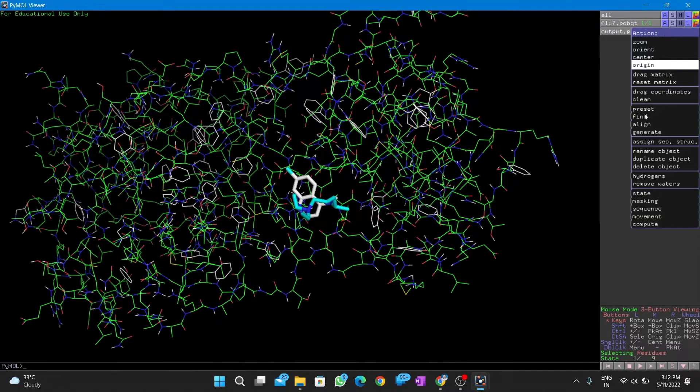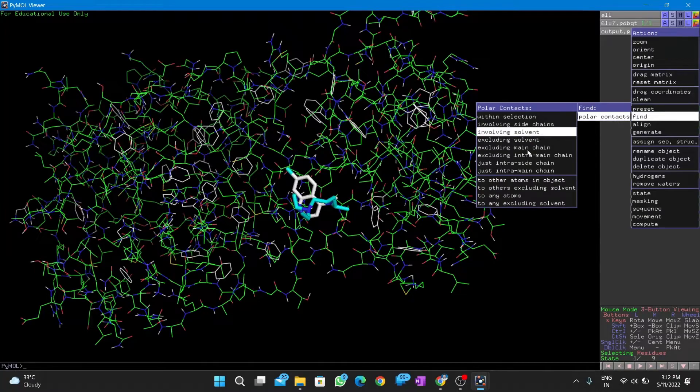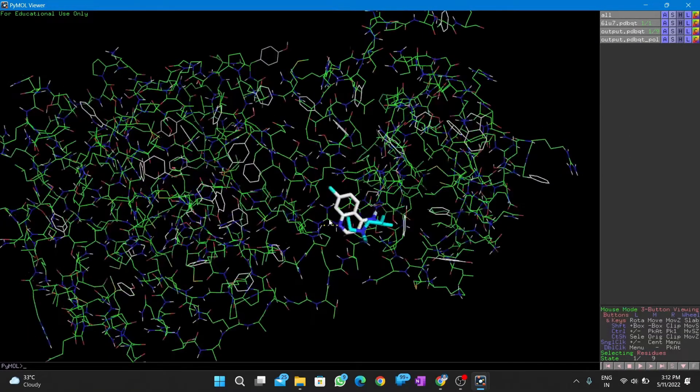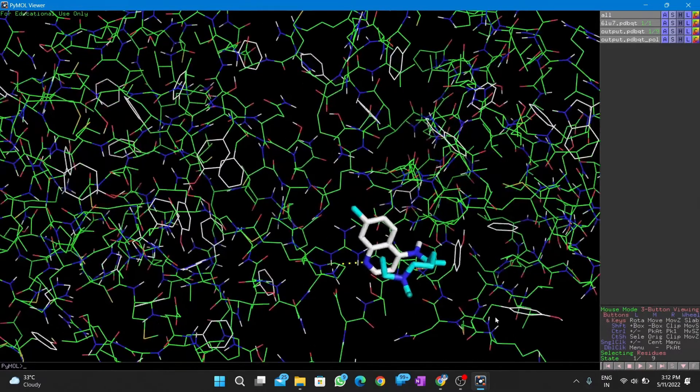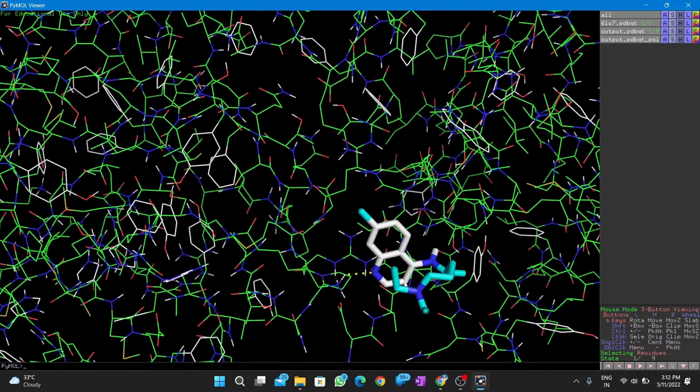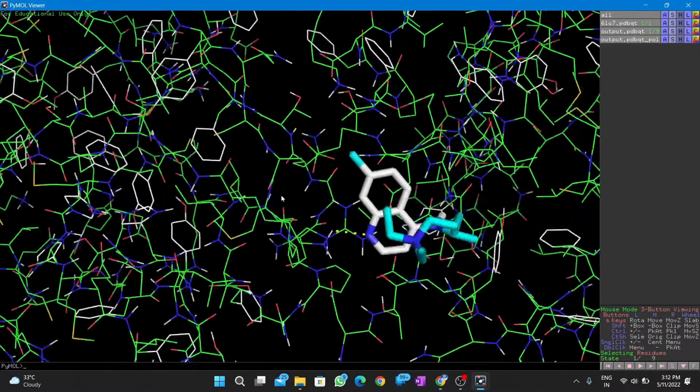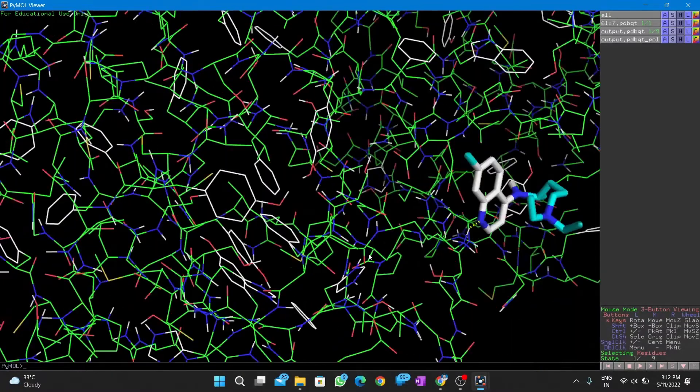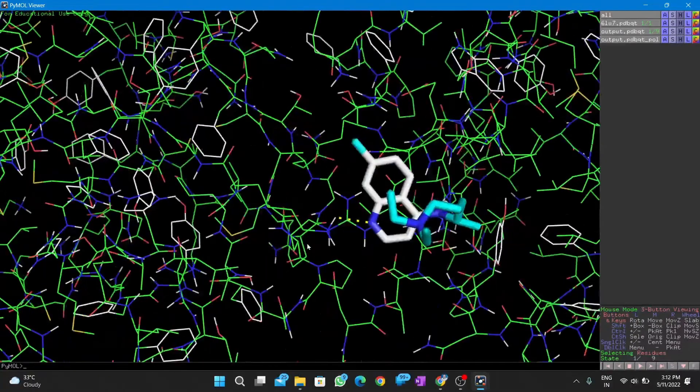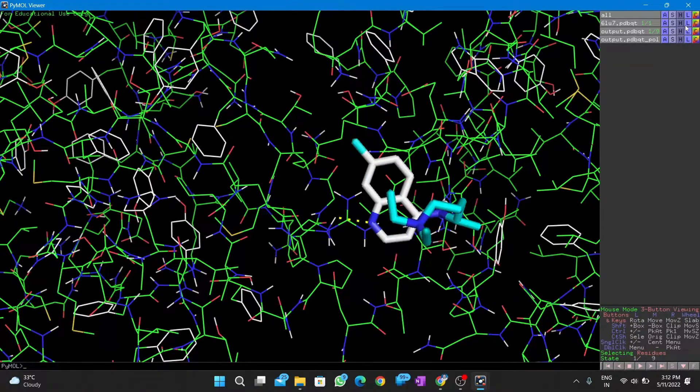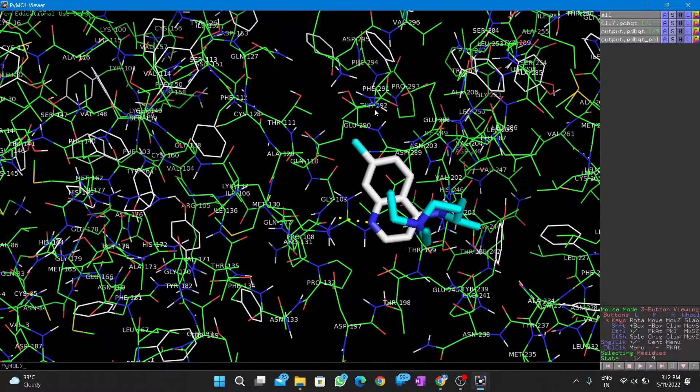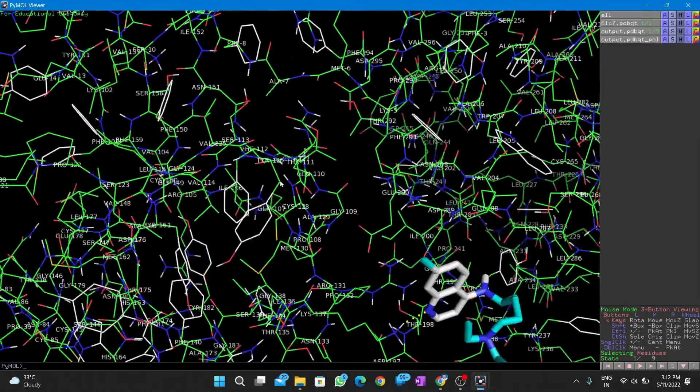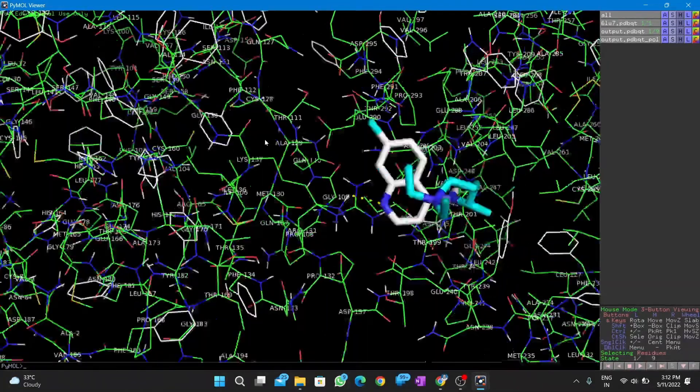Next, we can search for any polar contacts of the ligand with the nearby residues. You can see the polar contact as a yellow dotted line. We label each residue in the macromolecule so that we can identify which residue is making polar contact with the ligand.